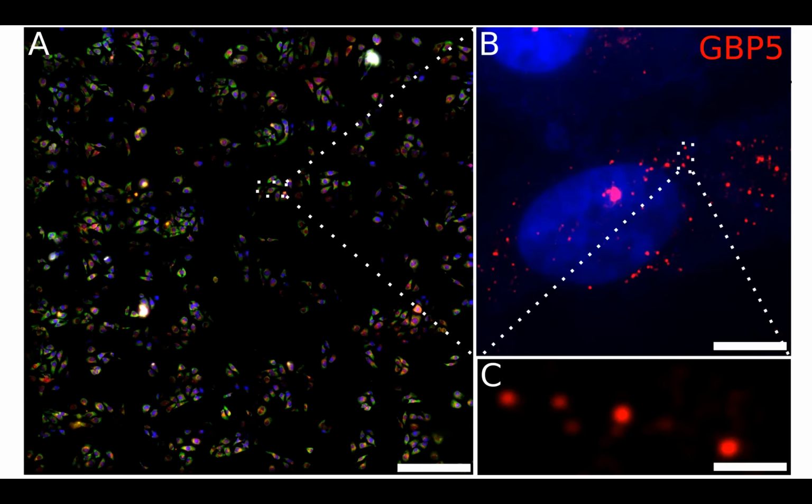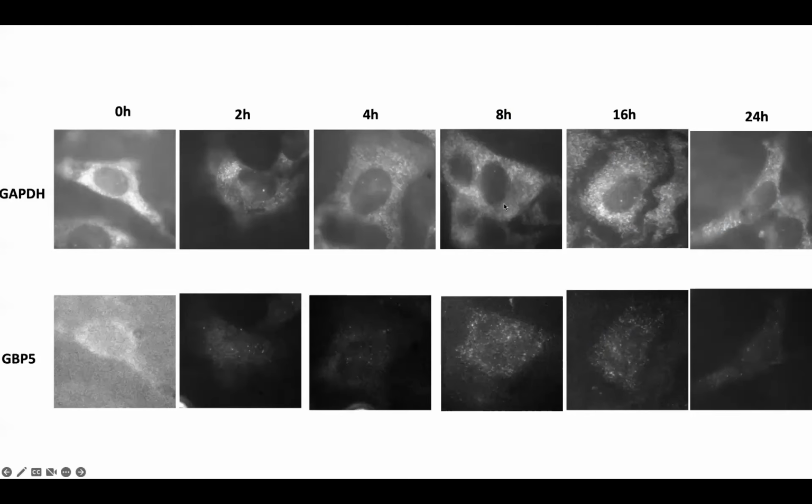And for each time point, we need to collect about 1,000 cells for the following quantitative analysis, and for each slide we have about 2-3 terabytes of data. So we definitely spent a lot of time to figure out computational tools to optimize the processing.